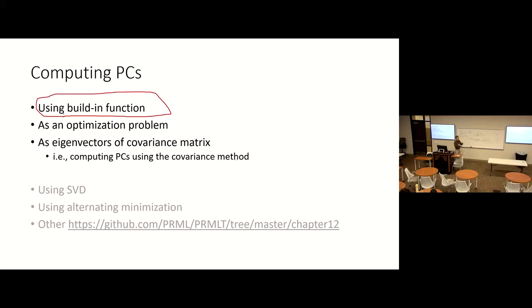The PCA built-in function normally will help you find the rotation matrix and rotate your data, and give you the coordinates in the new system. So your numerical description of your sample will change. The numbers will change. And then you can decide, I only visualize the first 2D, and it's good enough most of the time. So it's 3D, and you do it for visualization purposes.